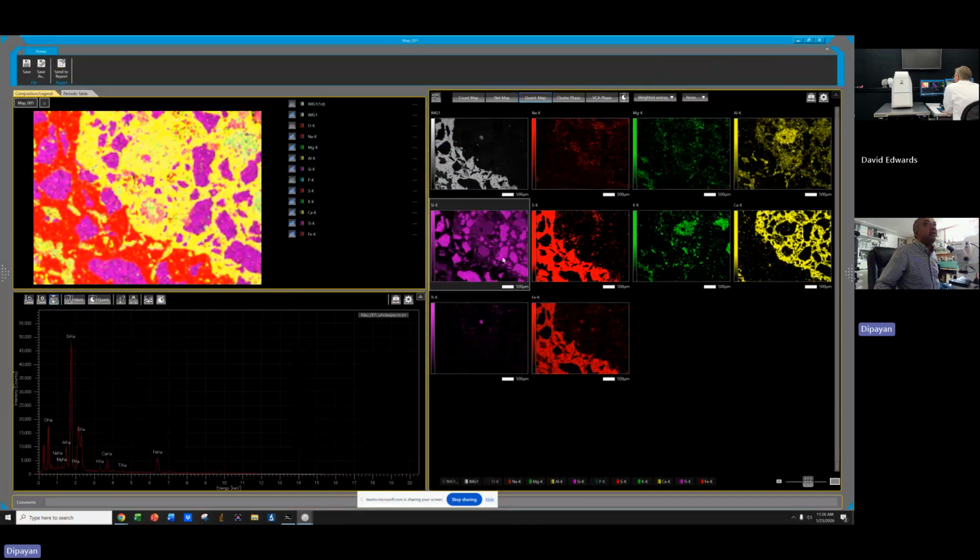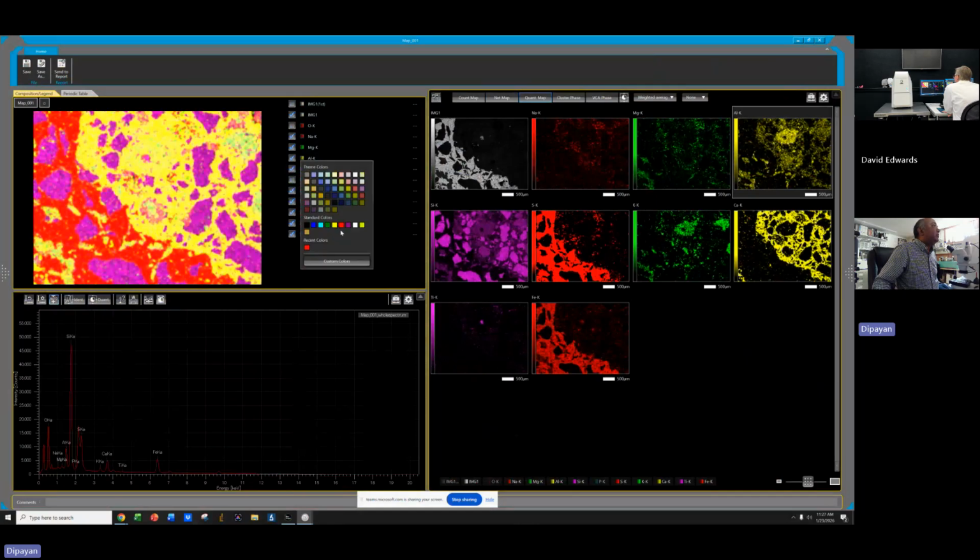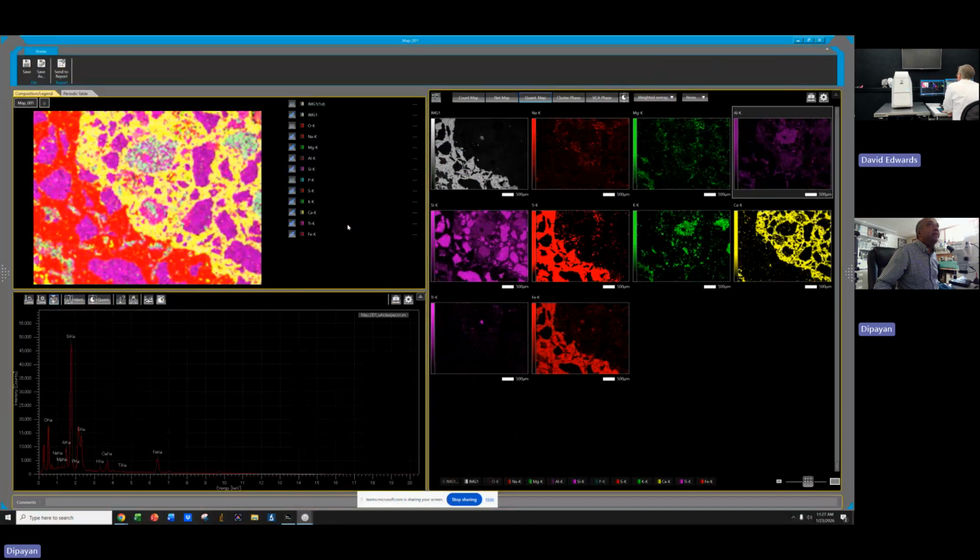See, quartz can stay in one color. See, alumina and paste cannot be the same color. But alumina is going to be linked up with whom? Alumina can't be linked up with anybody. So I really have to change the alumina. See, I can choose a weird, like these colors are useless. They are so dark. I really have to put in brighter colors.